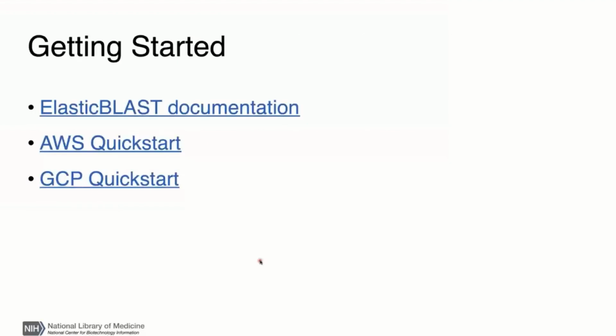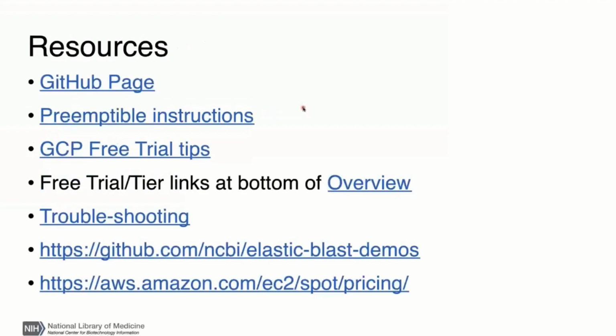Okay, so here are some links to help you get started. And I recommend starting with the top one here. And that will introduce you to ElasticBLAST, some cloud concepts, and then guide you to a quick start to try things out. If you're already familiar with the cloud concepts, of course, you can skip over those and just read about ElasticBLAST.